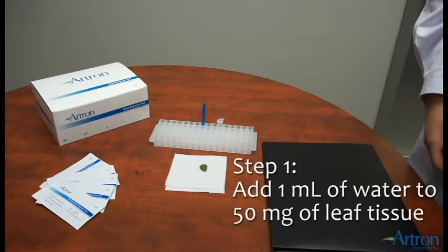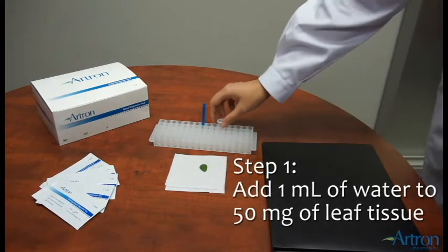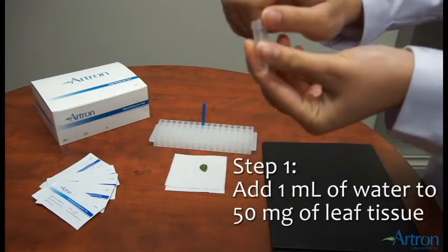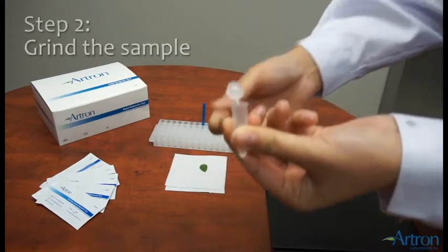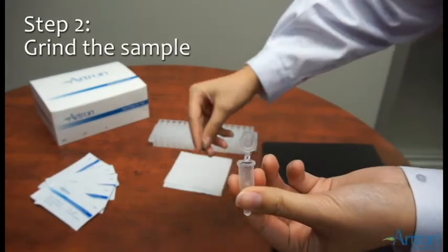To prepare the sample, add 1 milliliter of water with 50 milligrams of leaf tissue and grind the sample with tools such as a mortar and pestle.